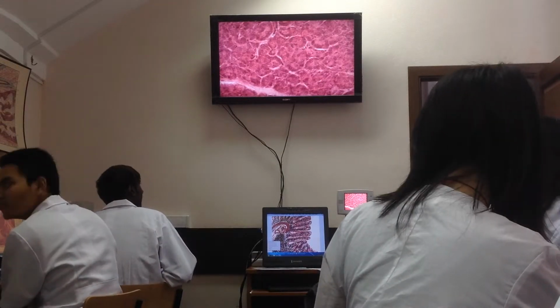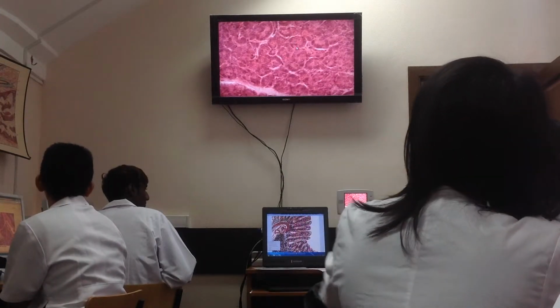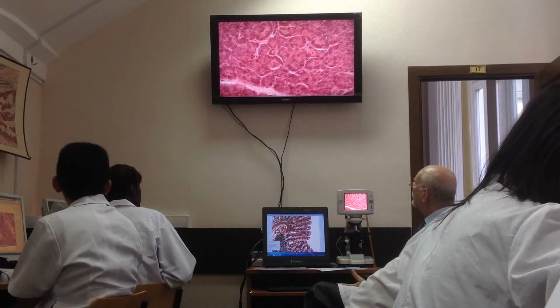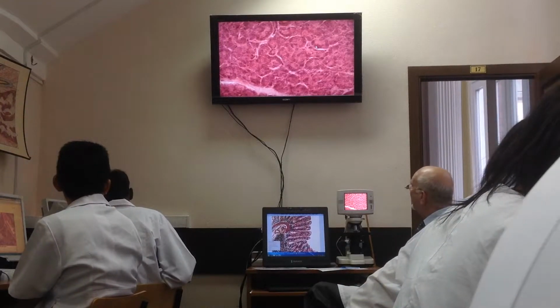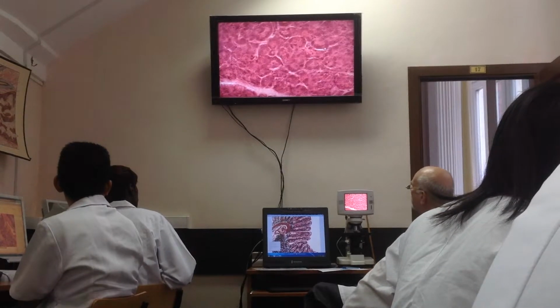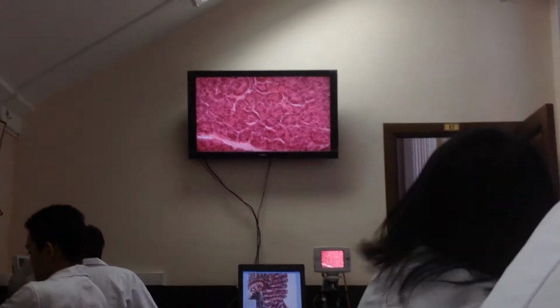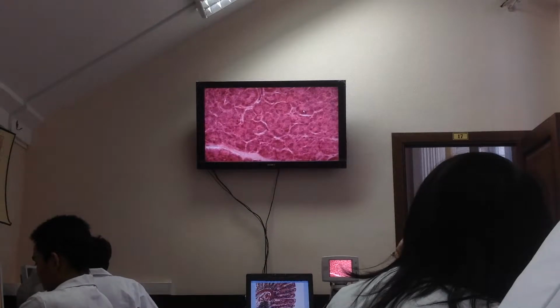Pay attention. Acinus. Acinus cells, nuclei. These cells form an acinus. Another acinus and the nuclei of its cells. But pay attention to the cytoplasm. Cytoplasm is more colored peripherally and less colored in the center of the acini. Or we can say more basophilic and more oxyphilic. Basophilic zone of cytoplasm and oxyphilic.